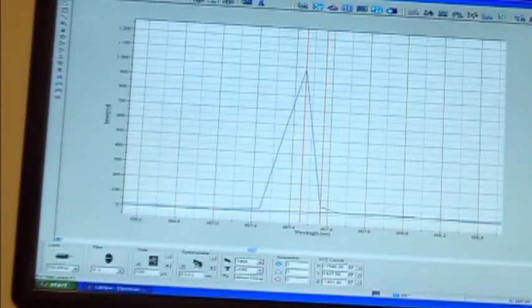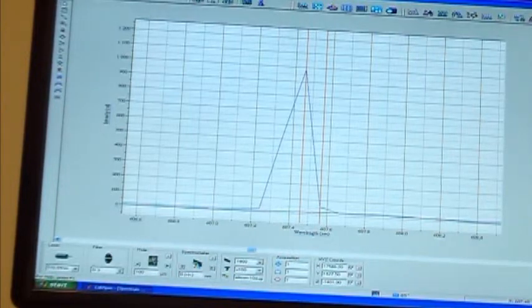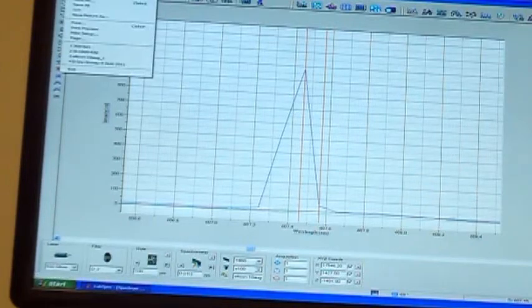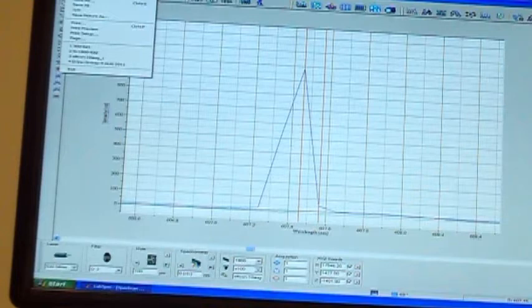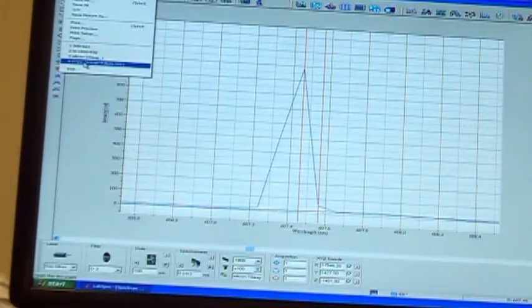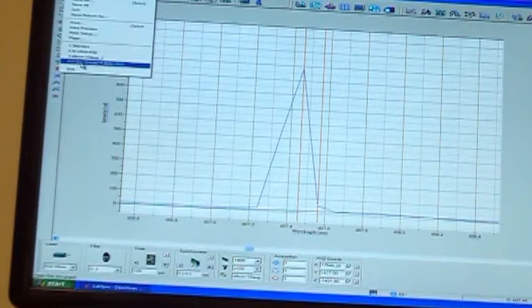Alright, now we will go through the top edge of the software where it has the little words written: File, Edit, Data, Options, Acquisition, Video, Setup, Maintenance, Window, and Help. File is just like any other Microsoft Office program. Open, save, close, delete, print. And in the bottom, it'll save the last couple spectra that you had opened for quick reference, just as if you were using the file option in Word.